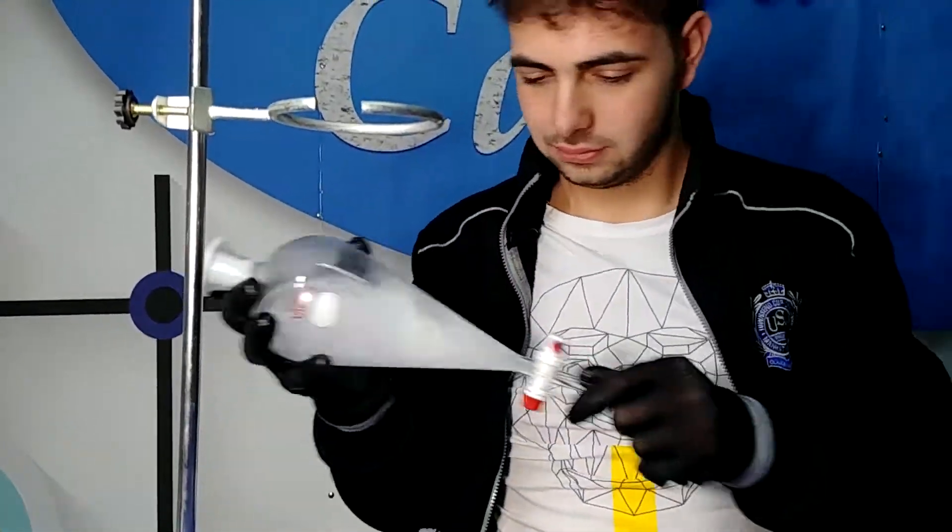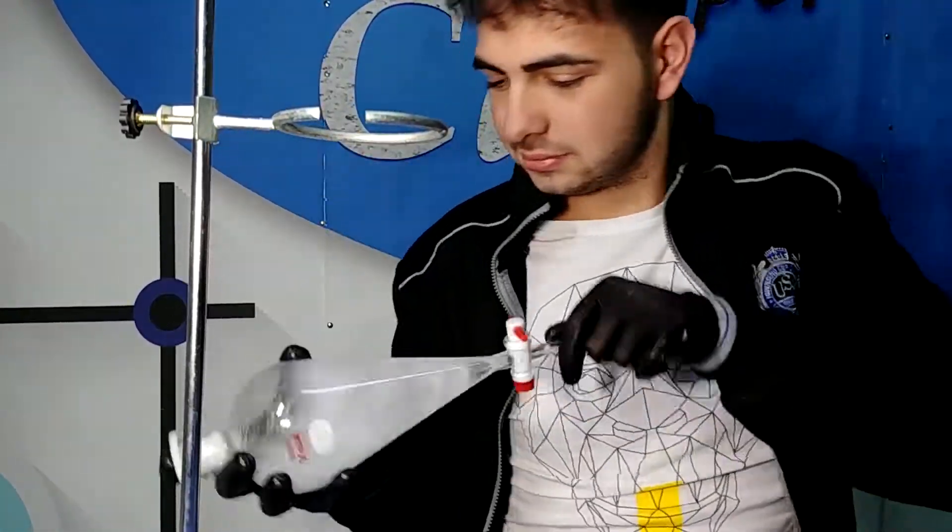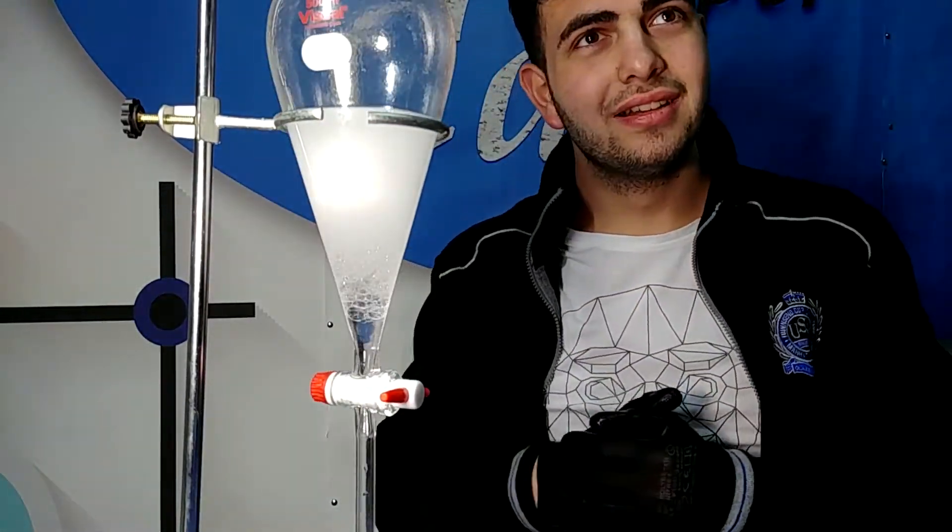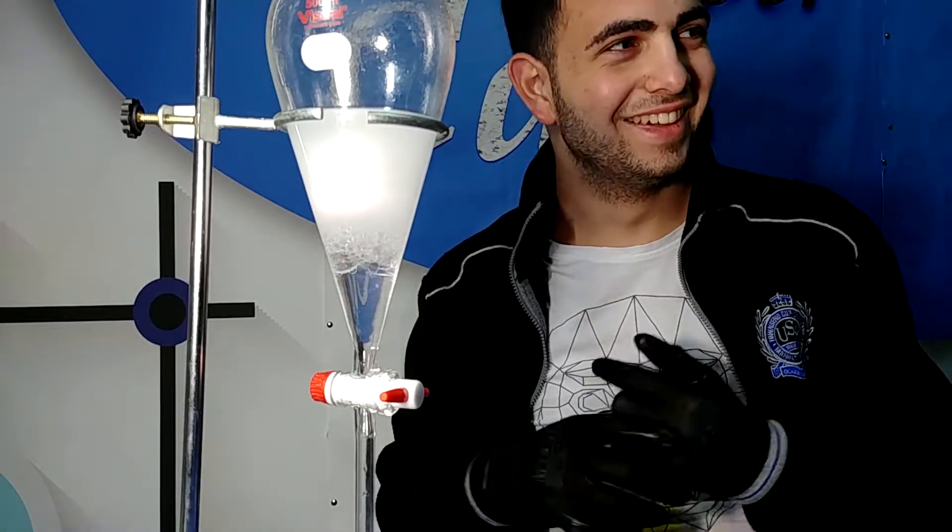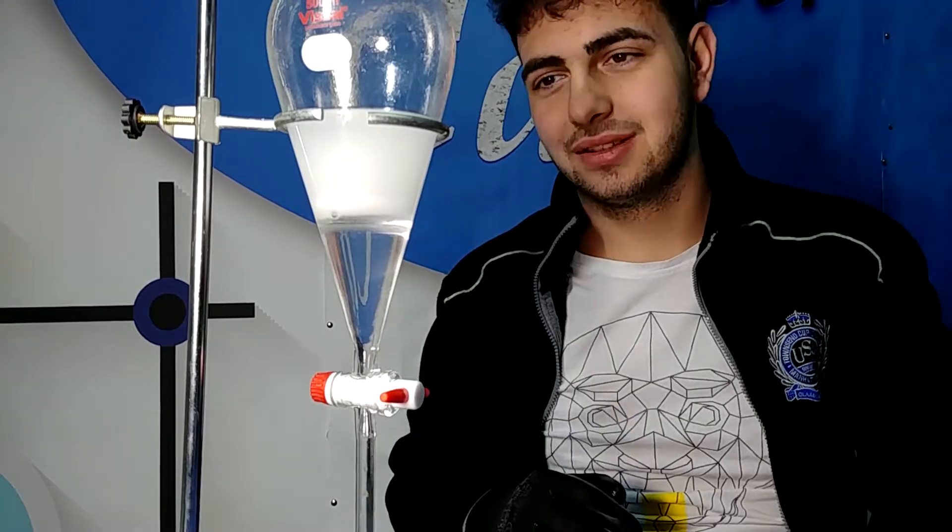After that we just have to put everything together in a separatory funnel. Using DCM that is an apolar solvent we can extract our essential oil because they are both apolar and they are really friendly with each other and they tend to mix with each other.